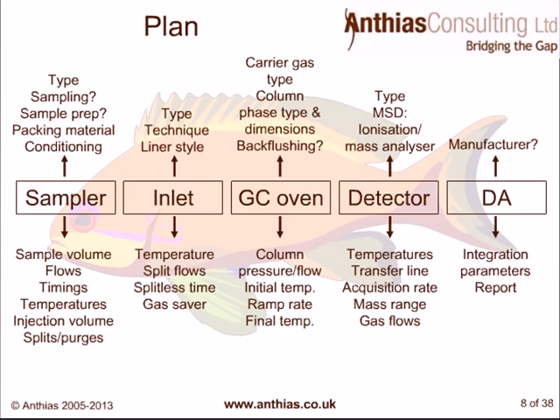The number of times that I see people printing out some results and then typing it into a different type of reporting software, that takes time. So, can you quantitatively move things across? Can you get the report out in the fashion that you want to? Because all of these take time. So these are the types of things that you need to be thinking about, so you can draw up a plan which is suitable for your application, and suitable for the instrument that you have chosen to use.